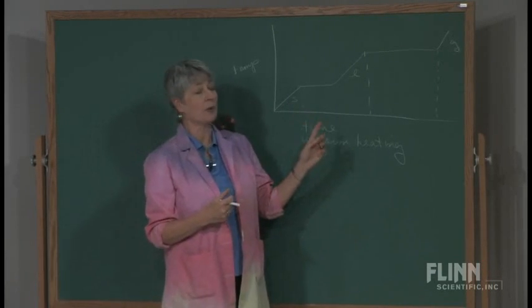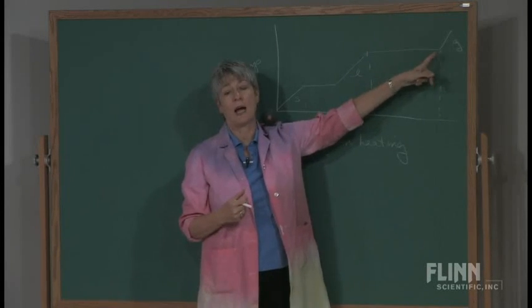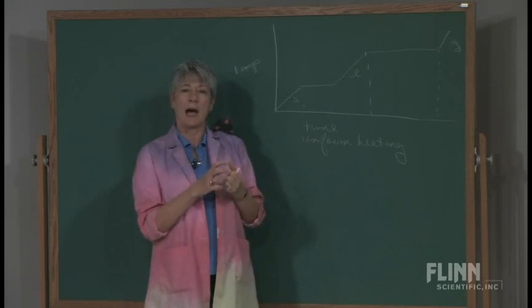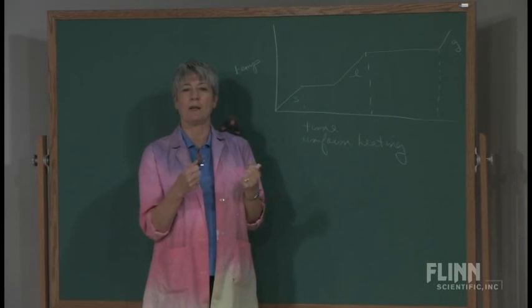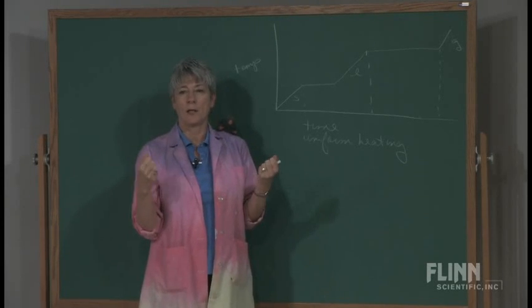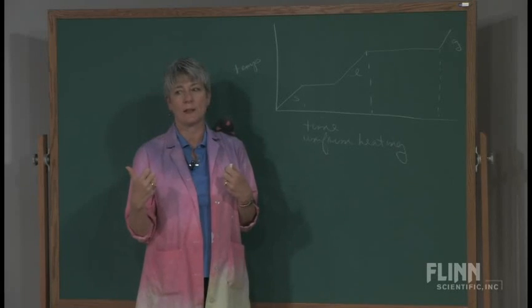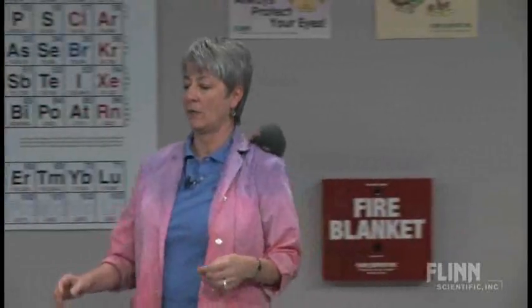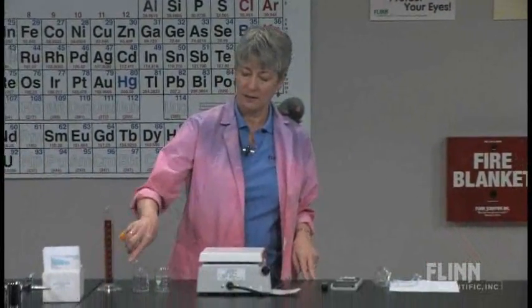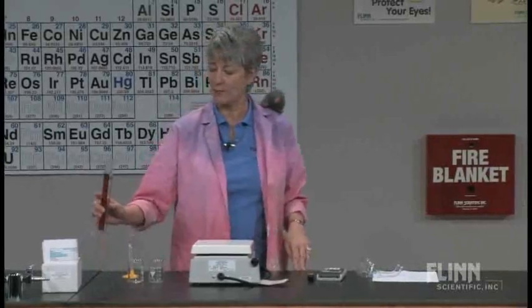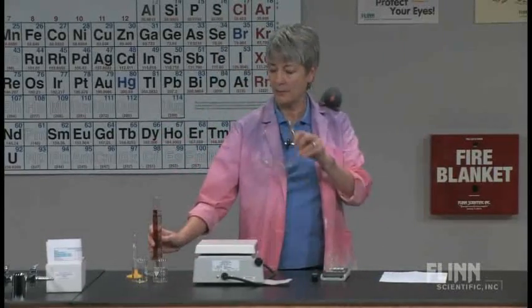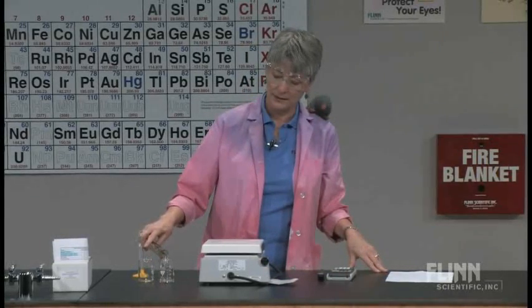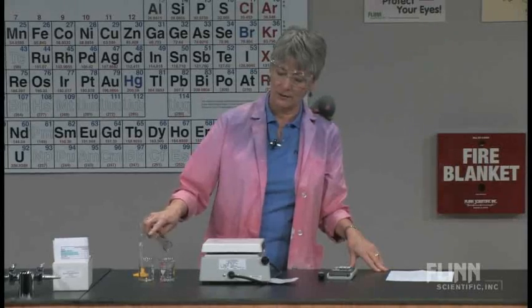So what we're going to do is measure how much energy does it actually take when we're boiling water. How much energy do you have to put in to pull apart the water molecules from the liquid arrangement into the gas arrangement? And we're going to start out with five grams of water, which I've measured as five milliliters. Let me put my goggles on.